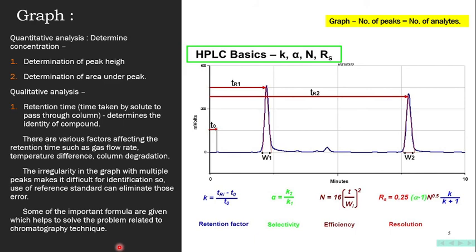First one will be the retention factor. Second one is the selectivity. Third will be the efficiency. Fourth will be the resolution power.